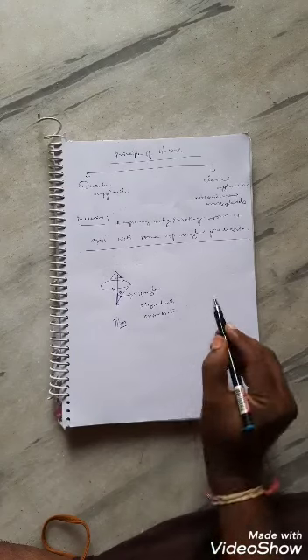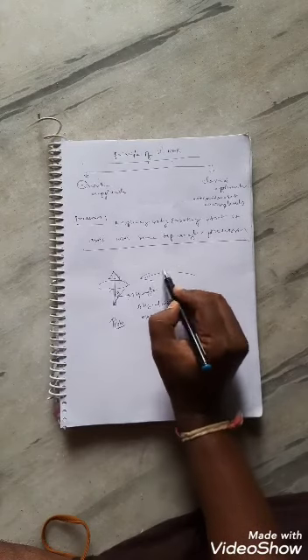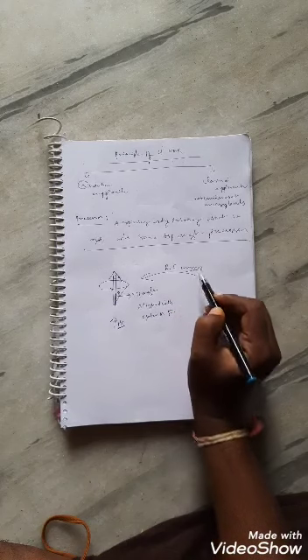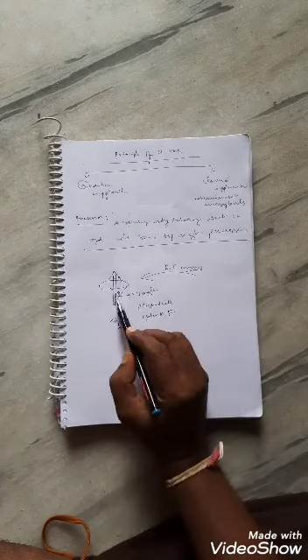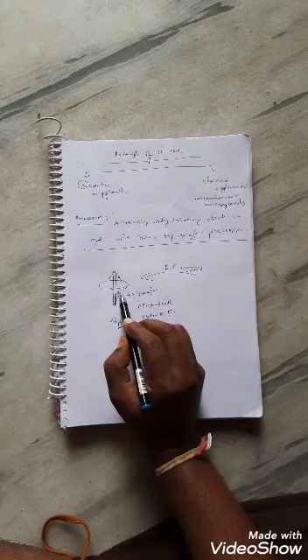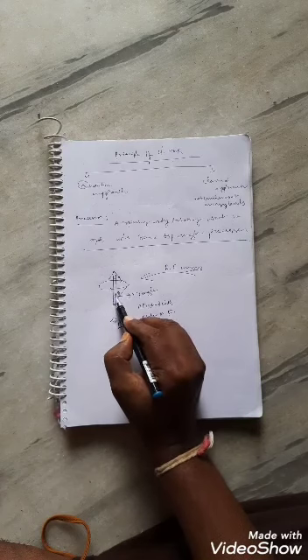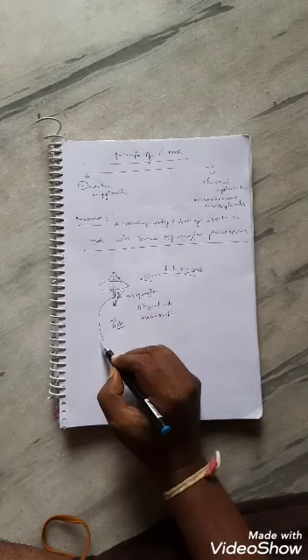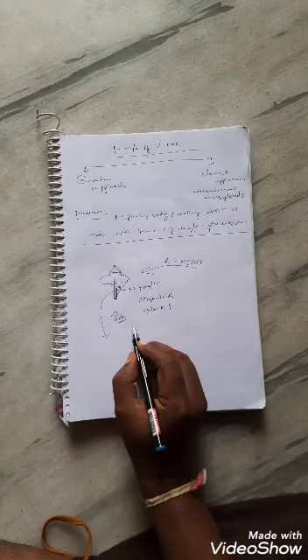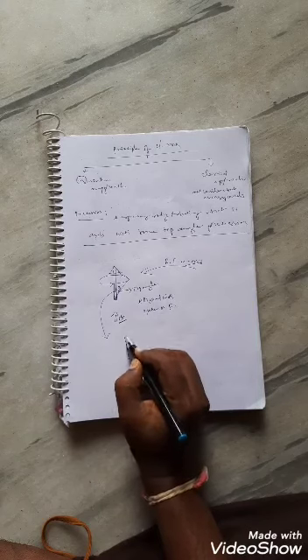And when you supply some RF energy, this spinning top or nuclear magnet will flip and convert into a higher energy precessing body.